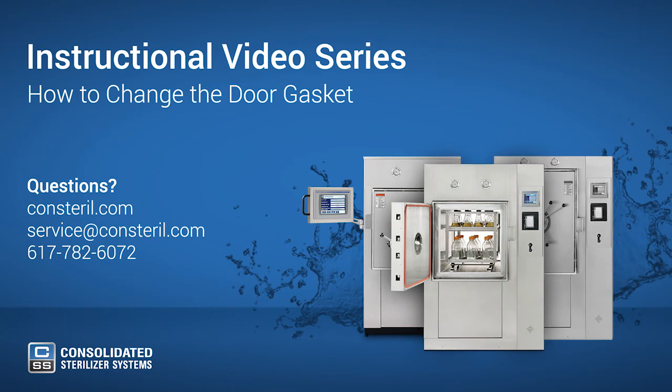After a final inspection of the repair, you should be ready to put your unit back in service.